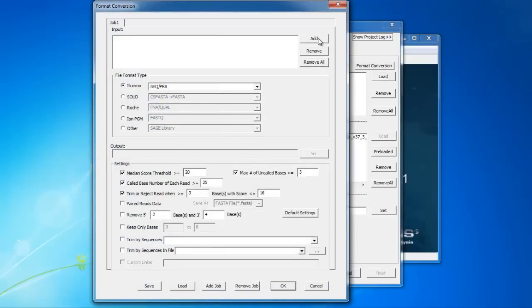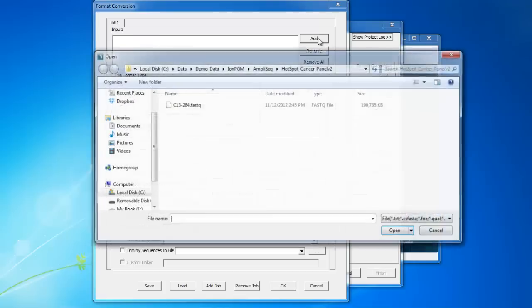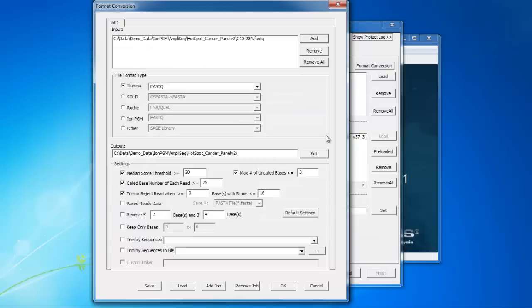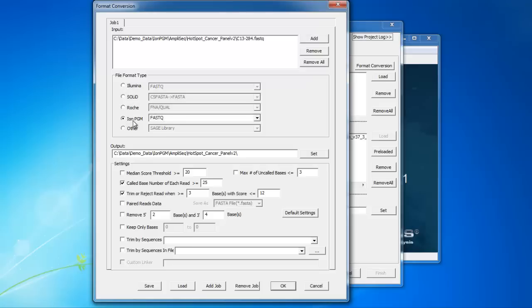Within the tool, click Add to browse to and select your data in FASTQ or SFF format. Once the FASTQ file is loaded, NextGene recognizes that the format is FASTQ. However, since Illumina also has a FASTQ output, you may need to manually change to the Ion PGM FASTQ option. The output location is automatically filled in, but can be changed as needed.